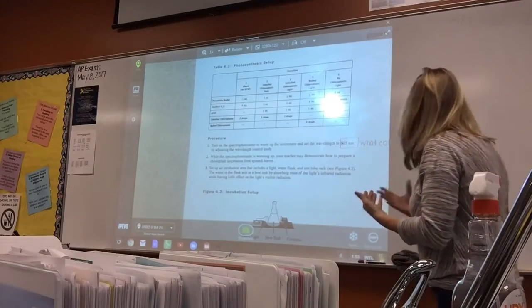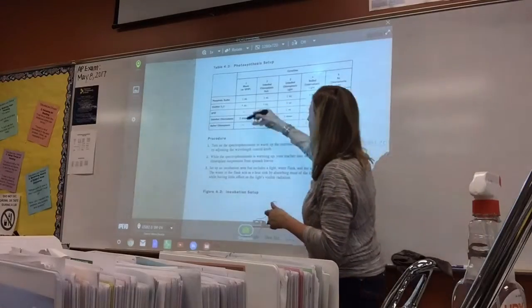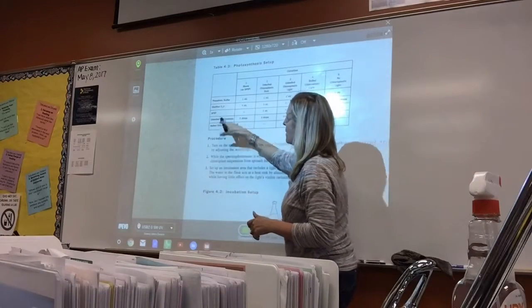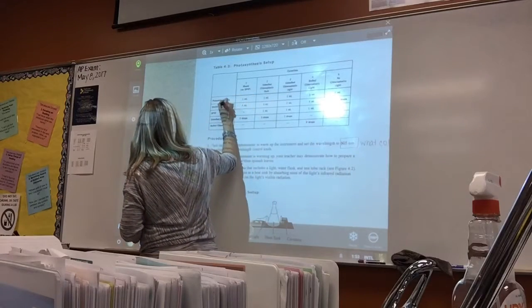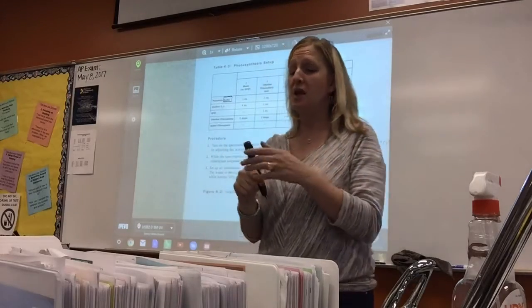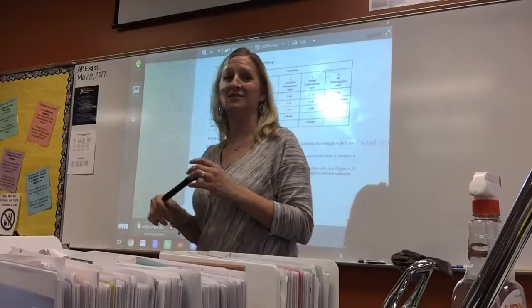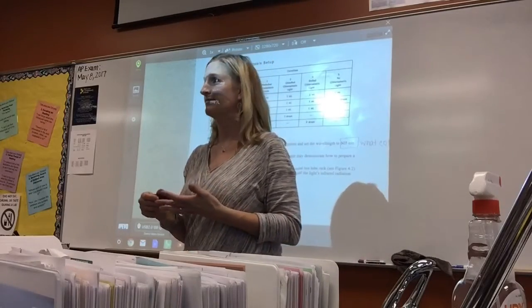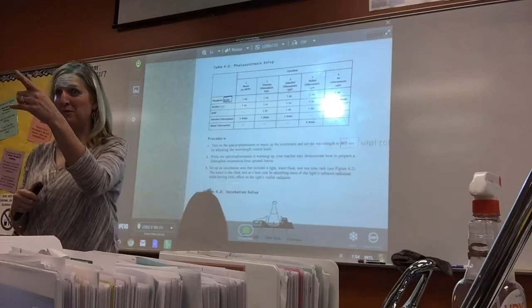And so you have literally for this cuvette, you have these different things in them. And so let's just talk about here the phosphate buffer. So not even looking at the word phosphate, the word buffer. We talked about buffers back in chapter 3. Everybody remember what in the world the buffers did? Do you remember, John? Yeah?